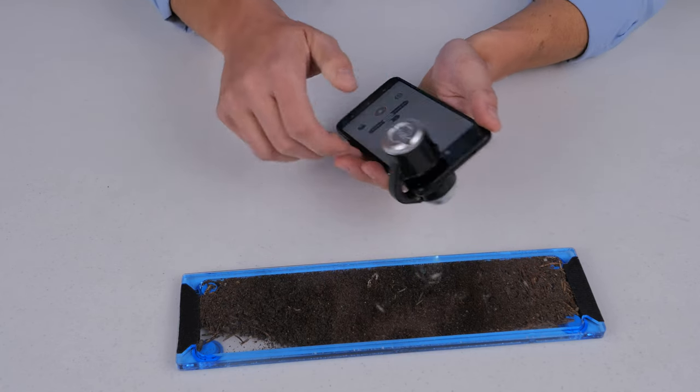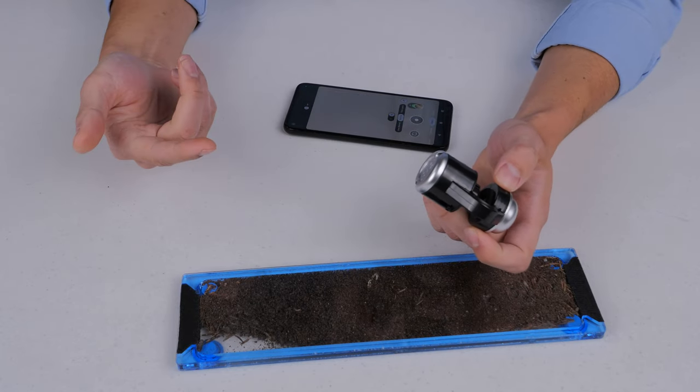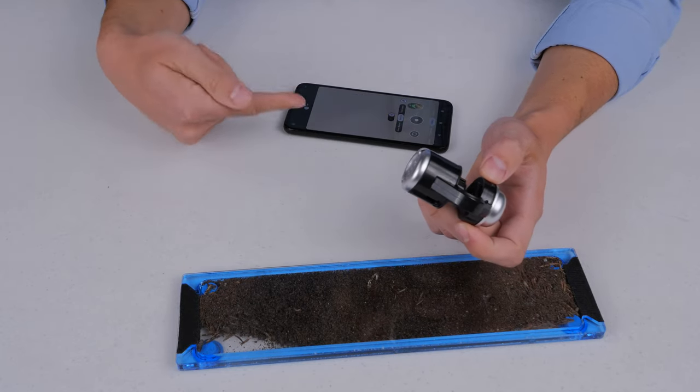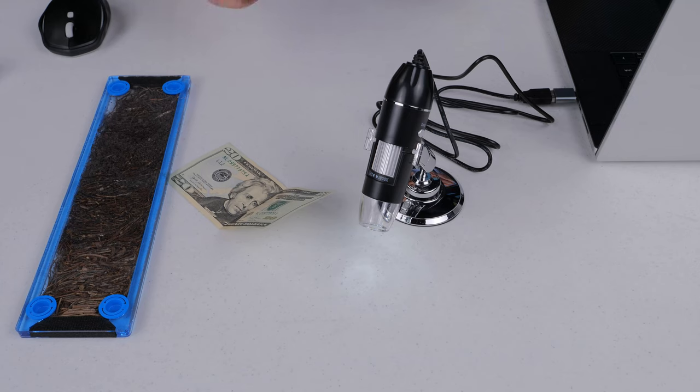The reason these things work really well is that if you have a good smartphone, it's taking advantage of the camera inside your smartphone, and that's why these really rock and roll.